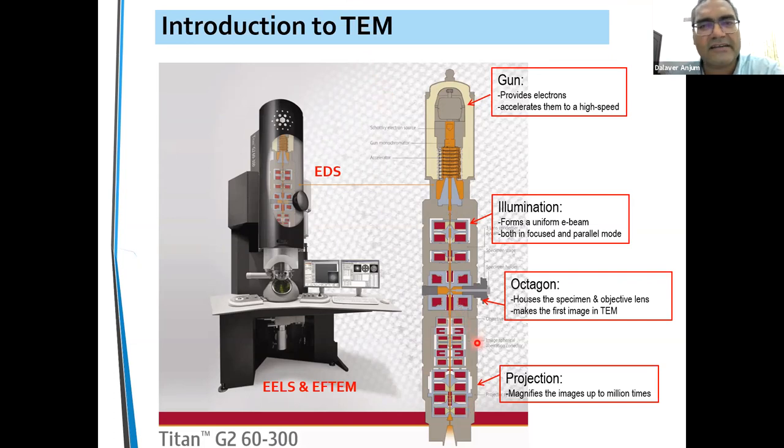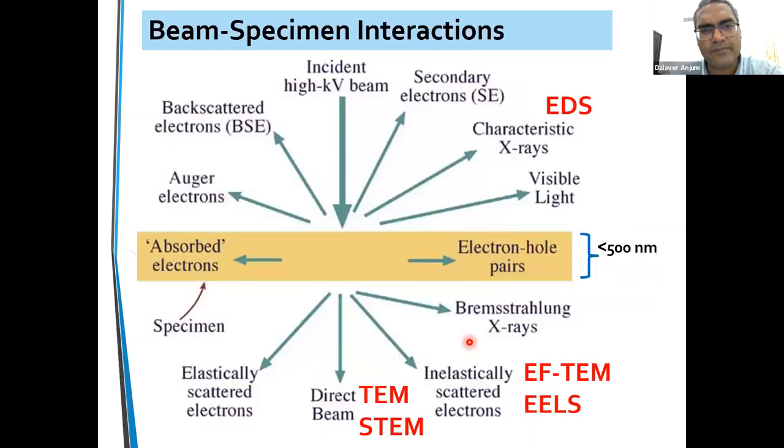So we put lots of projector lenses. They are also electromagnetic lenses. When the electrons pass through them, we end up having a very, very magnified image, the one you saw like the graphene sheet. So that's how we see. All right, and there are many other things that come with this tool. As I told you before, modern imaging devices don't come with imaging capability only. They come with EDX, energy dispersive spectroscopy, and electron energy loss spectroscopy. And I will go into details about that as well.